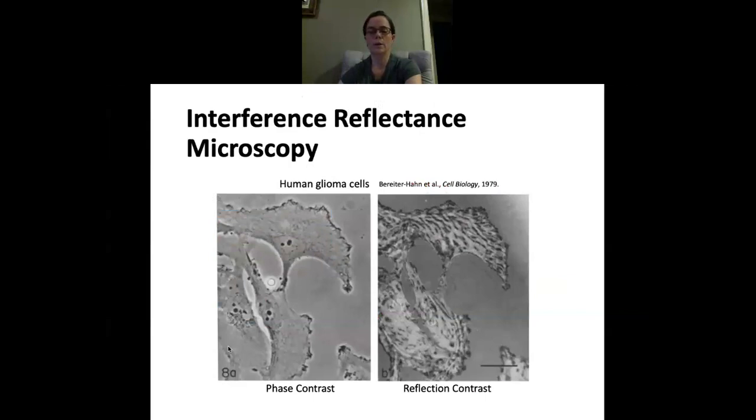Here, for example, are images of phase contrast and interference reflectance microscopy in comparison. Reflections off of biological interfaces are very weak, and most of the illumination is lost to transmission. However, the optical enhancement that can be done with polarization control or with computational enhancement through digital filtering can increase the image contrast and allow you to observe things that can't be observed with other methods.